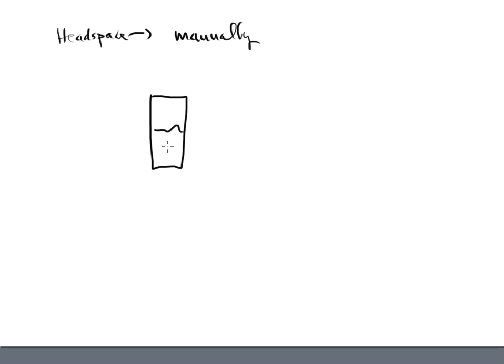I also want to say that we've talked about this sample. And this sample, I said, listen, you've got some components in here that you want to measure. It's very good if those components are in a higher concentration. So this headspace really should not be used for trace amounts. That's really the purpose of the purge and trap, and that's what you're going to learn about in the next folder and then in the next couple of videos that you'll watch. But the headspace typically works out a little bit better if the compound is present in a large amount where you don't need any kind of specialized detector to get that low.